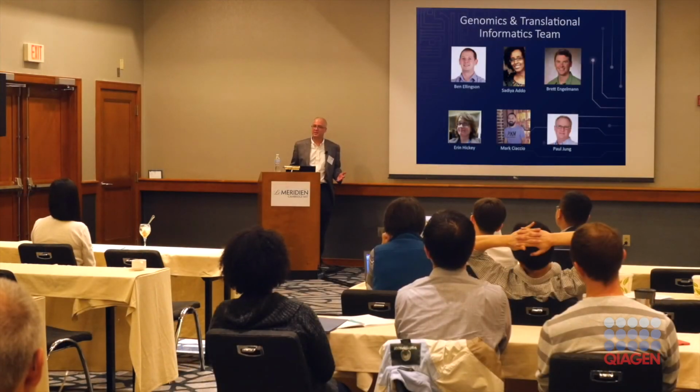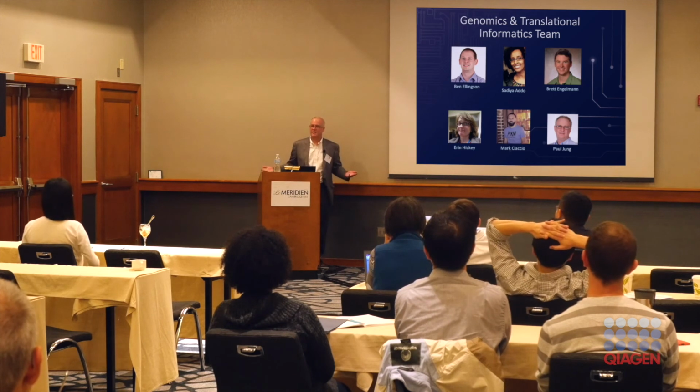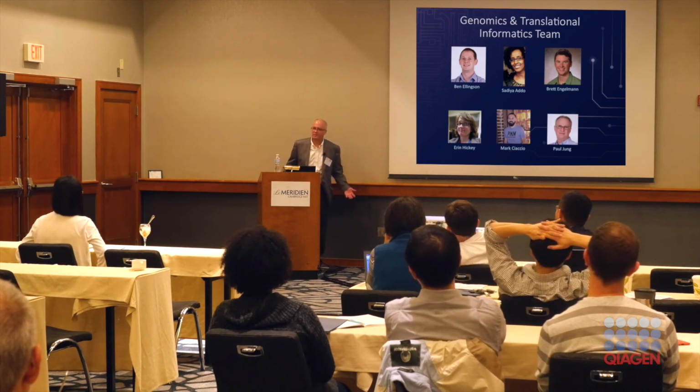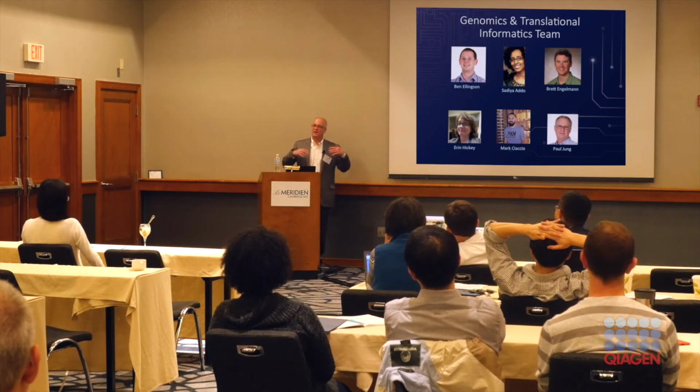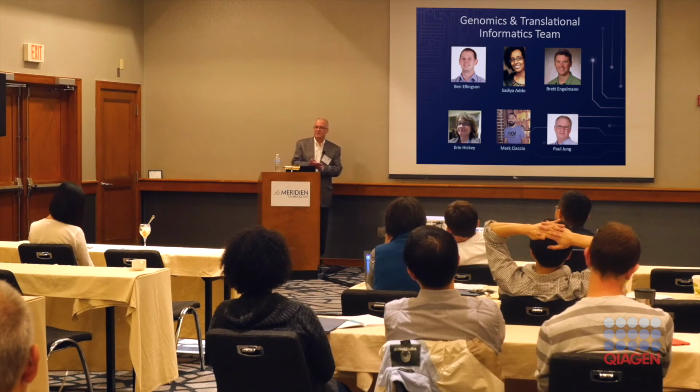We certainly had an external site with a custom Affymetrix chip that had a really excellent set of tissues for a human body map, but it was just a crazy chip, and it was annotated, I don't know, 05 something. So we took advantage of that to realign the probe sets, reannotate the chip, bring that in. So we have used the services for some of the LAN work, and I think it's likely we'd want to do that more.